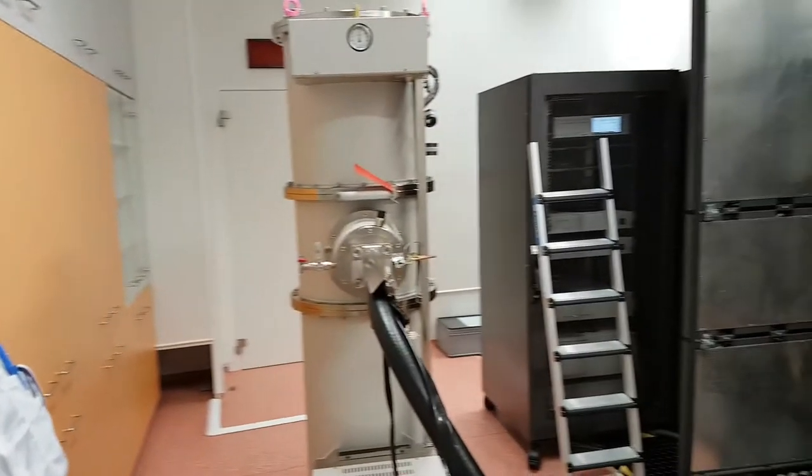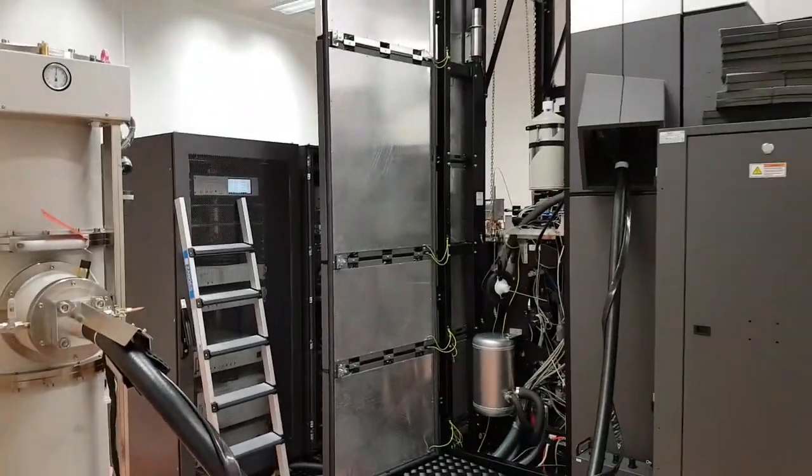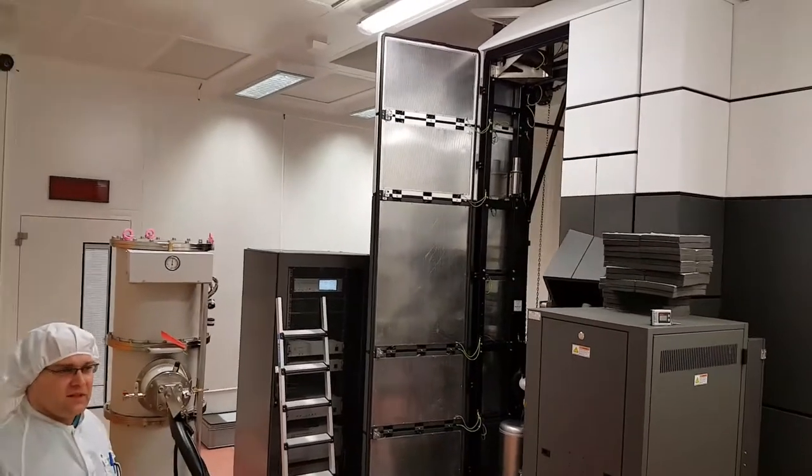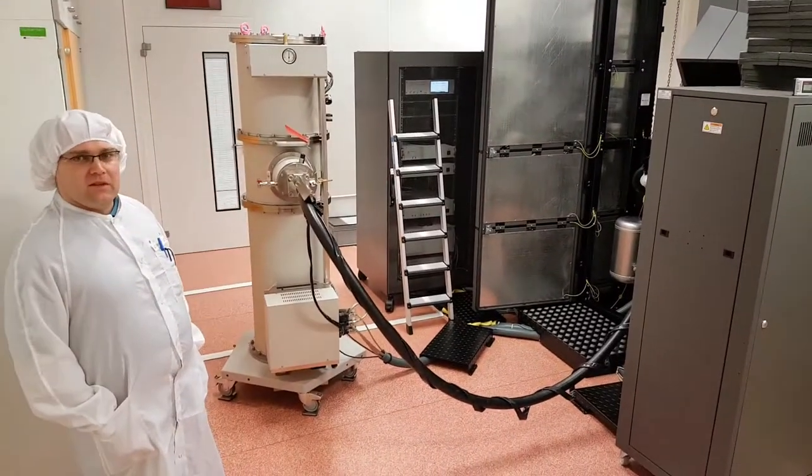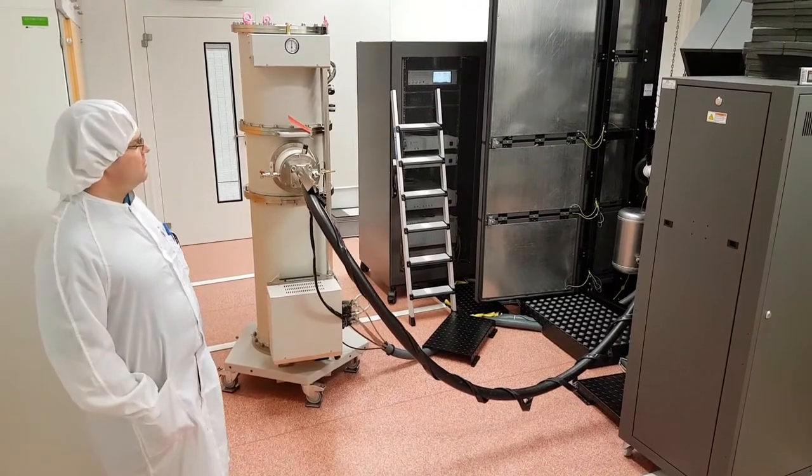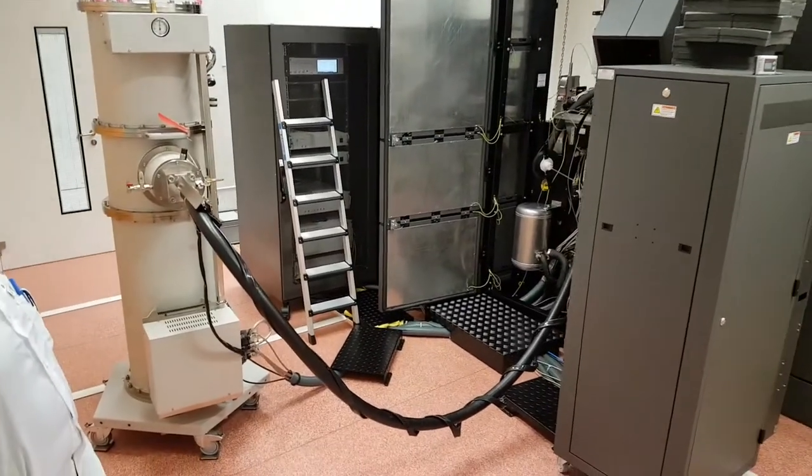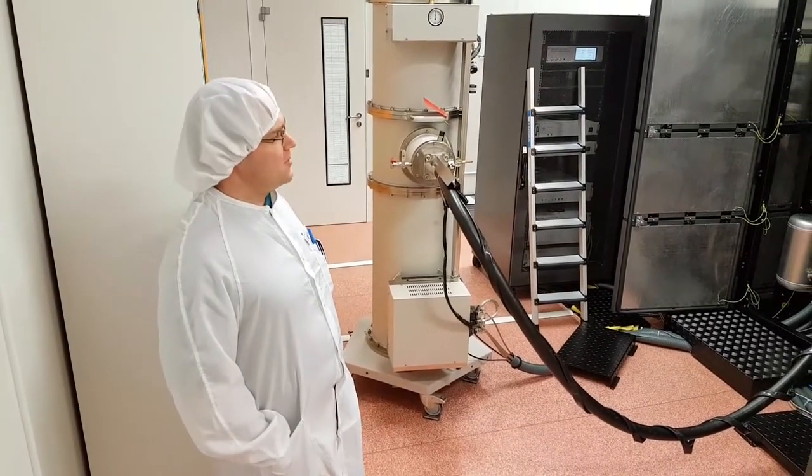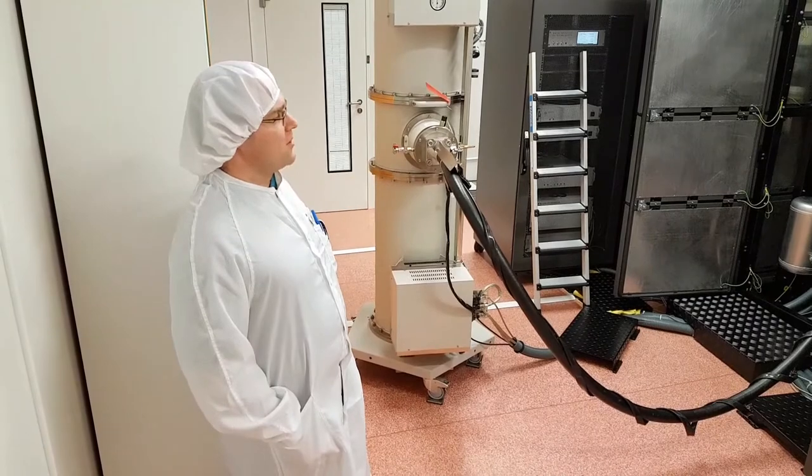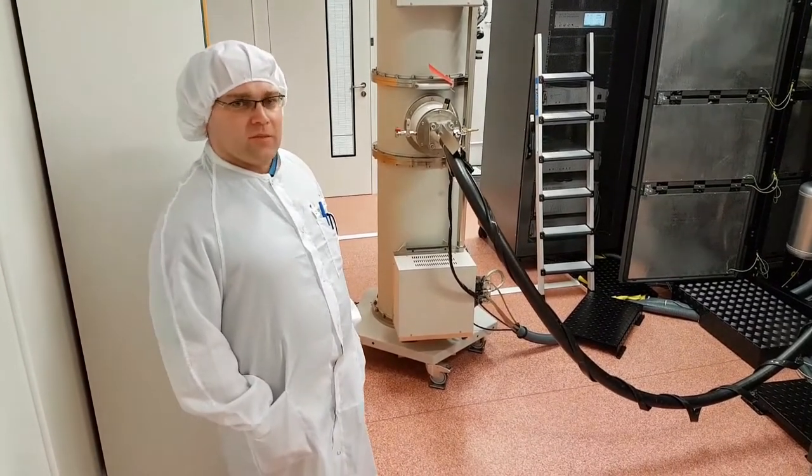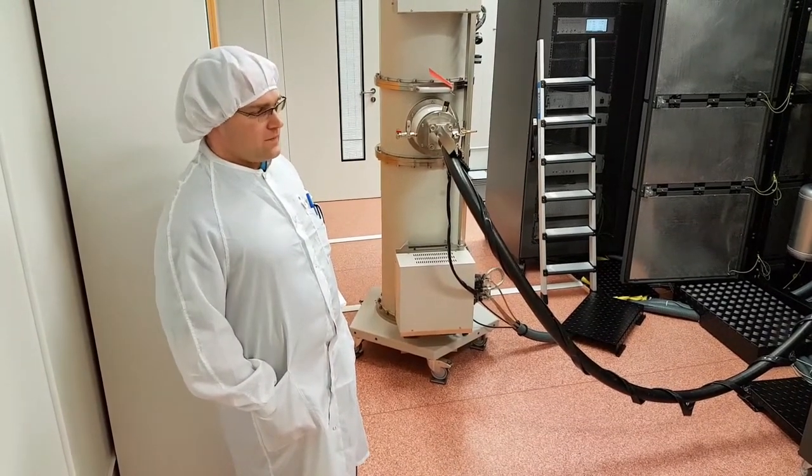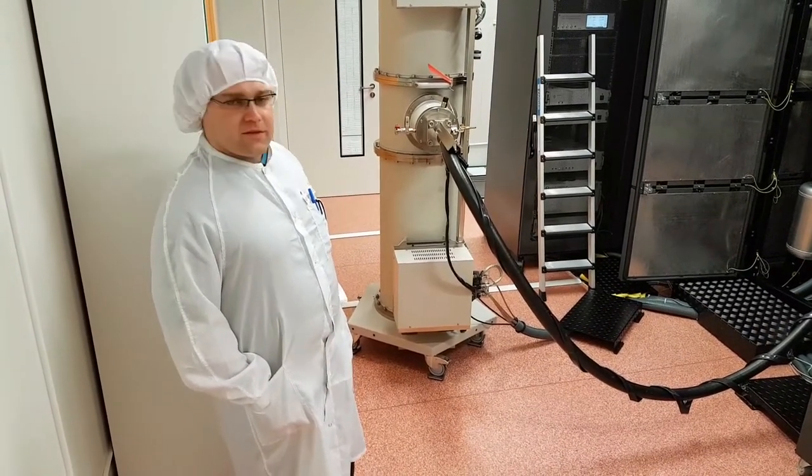Now we're looking at the transmission electron microscope. In our case, it's specified as high-resolution electron microscope. So under specified conditions, we can see atomic columns in crystalline matter. So we claim that we can do our work with atomic resolution, either observing the structure of the matter, or we can also do chemical analysis by using either the energy dispersion spectrometer or by using so-called electron energy loss spectrometry.